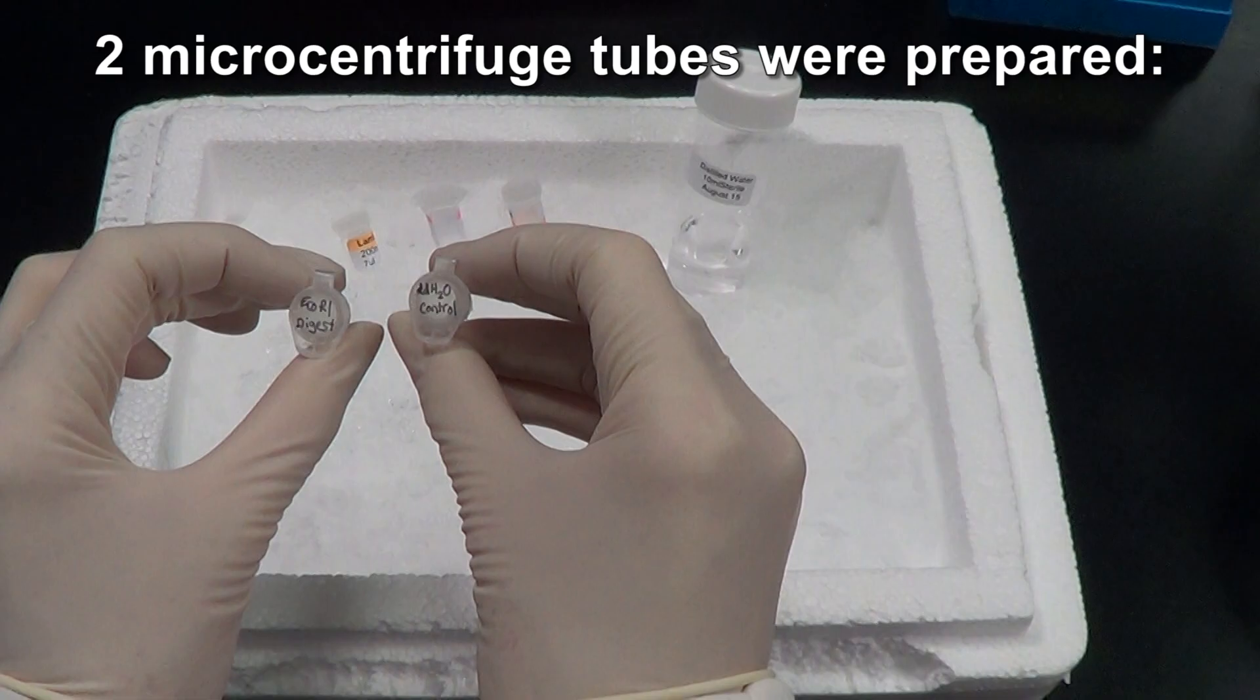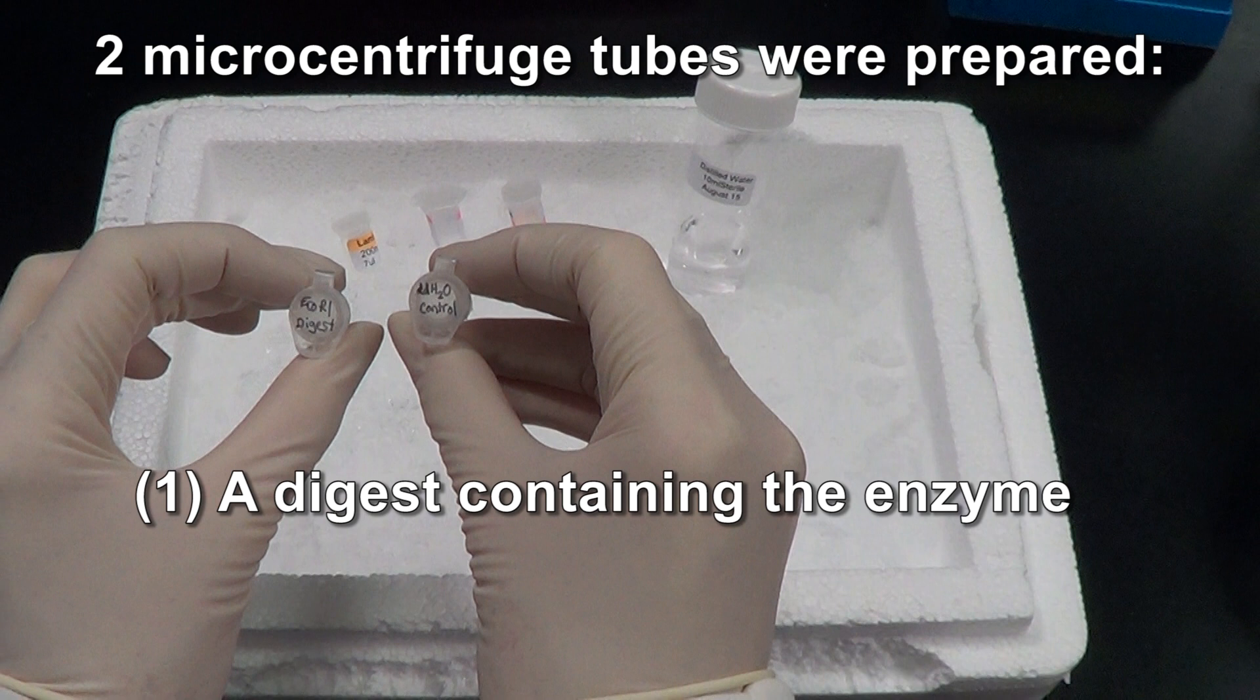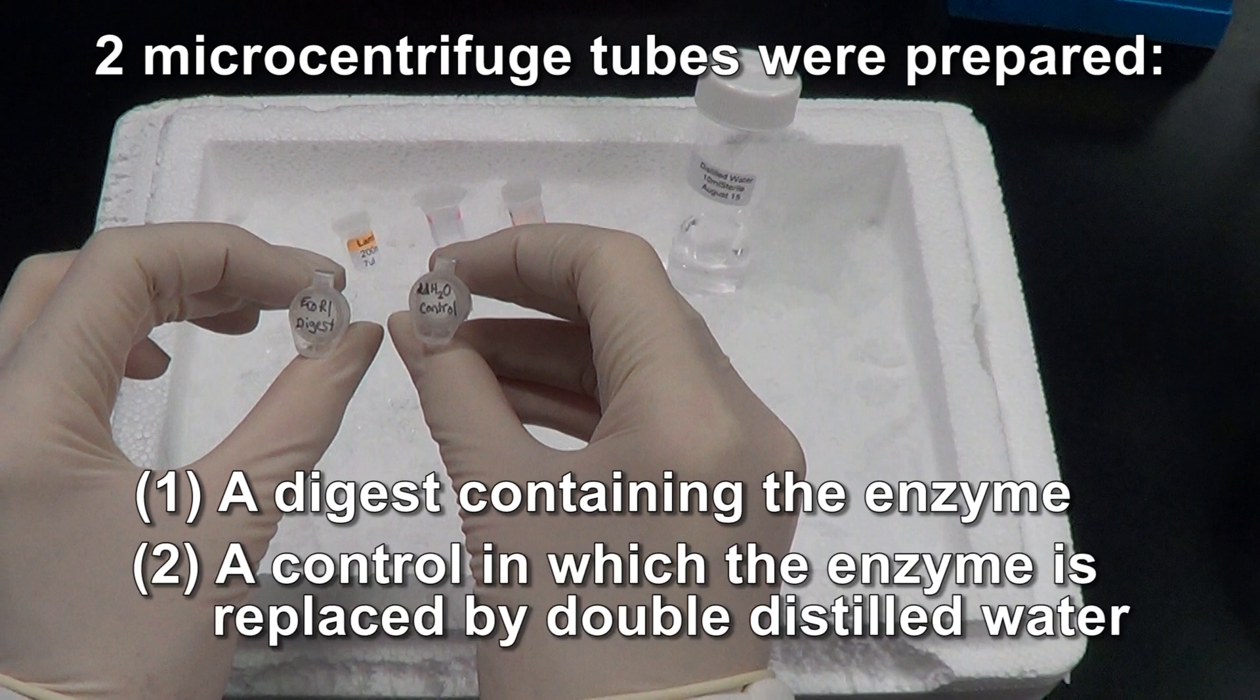In this demonstration two tubes were prepared: a digest containing the enzyme and a control in which the enzyme is replaced by double distilled water. Calculate the volumes required for each reagent before starting.